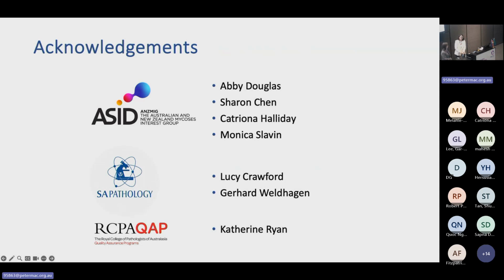So I don't think anyone would disagree with that, to be honest. Reporting both names is always helpful. And I guess from a lay perspective from my end, there's probably no downside to reporting both, as far as, once you've set up the system such that it's easy to do that, then there's really no downside in continuing that, would you say? Yeah, I would agree with that. I think setting up your LIS to report both names simultaneously can take a little while, but once it's done, it's very easy just to let it stay that way. I don't think there's any downside to it.